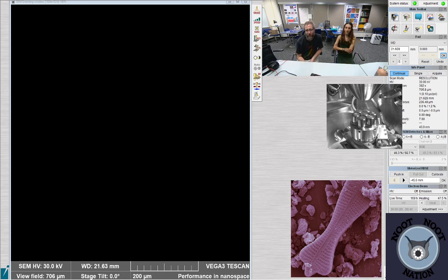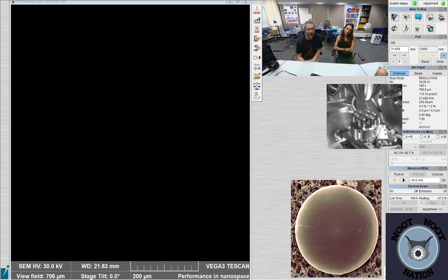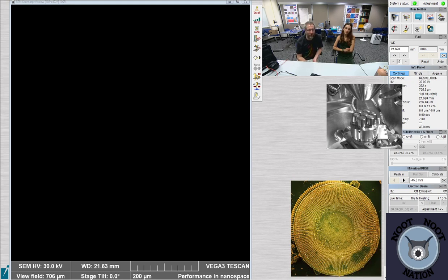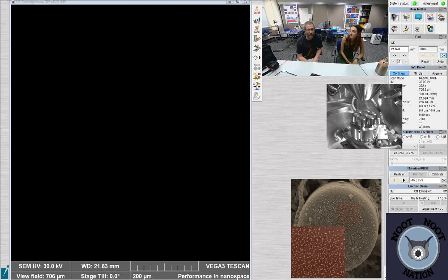Do I have a preference for live or fossilized microscope subjects? The deader it is, the happier I am to look at it in a microscope usually. Although, you know, if all the organic matter is gone, there's not a lot of difference between a fossil and a living organism. So as long as it's well cleaned, that's all that really matters. I mostly like to look at the dead stuff though, because I think we can get a lot closer and look at things a lot more, the ultrastructure a lot more closely in SEM or even in the light microscope if it's dead. If it's living, it creates a problem. Although, I think I did mount some of Pacific Plankton's samples where the chloroplasts were still in them, and I just went ahead and mounted them in Naphrax like that. Yeah, you can get a lot closer, and I think you can see a lot more.